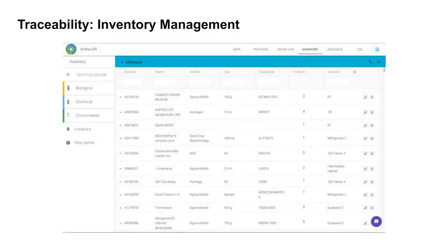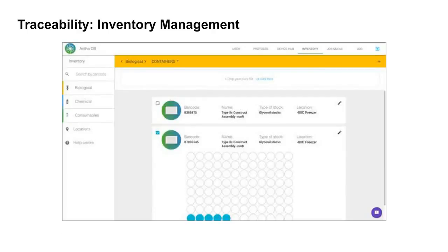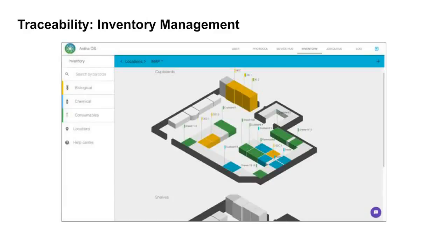So when it comes to actually working with Antha, it starts with sample management. If you don't know what all the physical objects are in your lab, what containers they're stored within, and what is the provenance of everything within those containers, and, of course, where those things are physically located, you can't, of course, properly describe the flow of samples and the flow of information through a workflow.